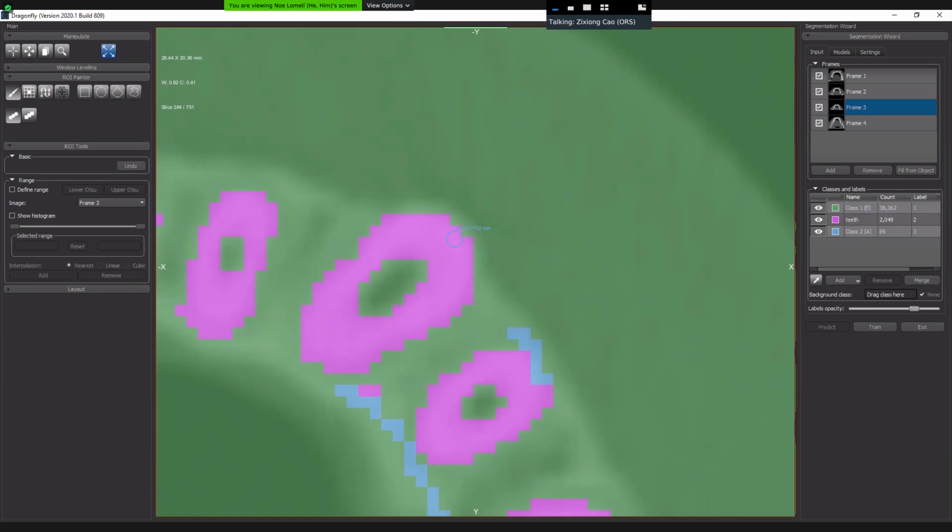In this case, my painter only paints on these two classes, so it doesn't take effect on the others. Like now I cannot paint here, but I can paint here. So it's like locking the other class and changing only your selected class.